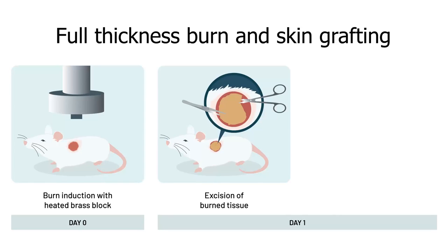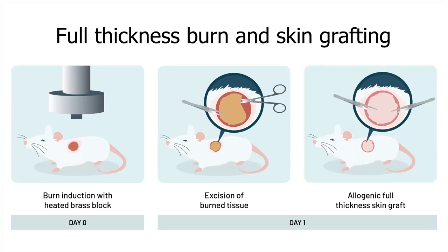Necrotic tissue was surgically excised 24 hours after the burn injury. Full thickness skin grafts harvested from the tail of a donor mouse were laid over the excised burn wounds. The grafts were then secured with a surgical adhesive.